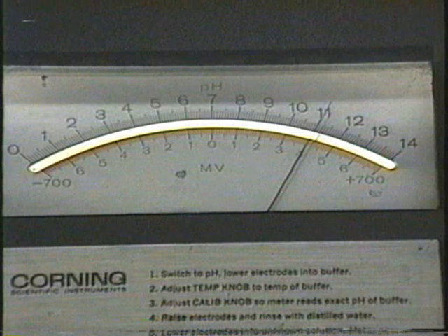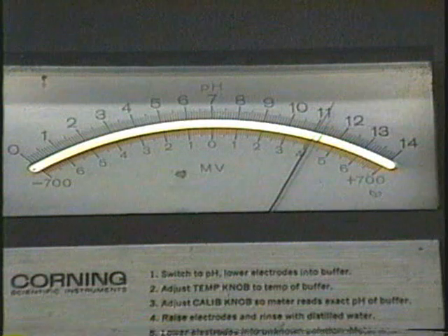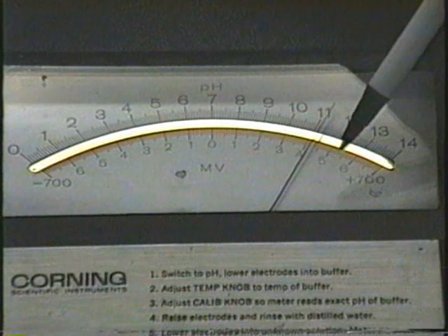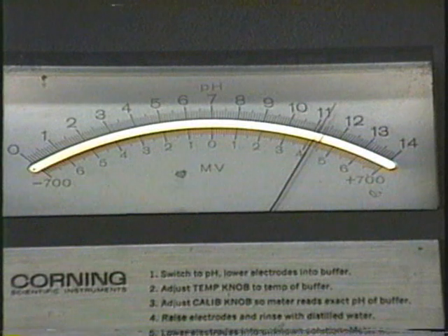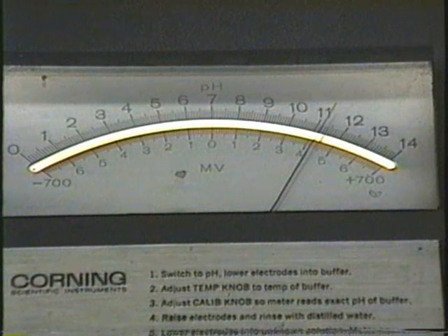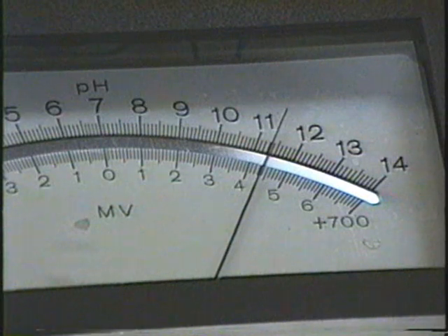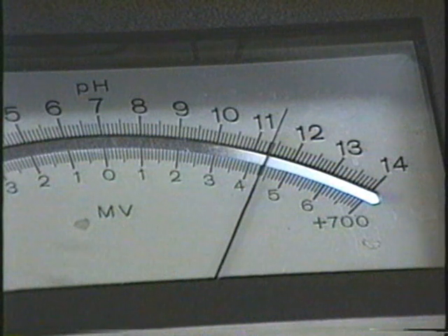Now, before we can take this reading, we must correct for the parallax error. As you can see, the camera's in the wrong place, and you not only can see the mirror, the needle itself, but you can see its reflection in the mirror. When this happens, you will have a parallax error in reading, so we'll have to move the camera to eliminate that parallax error. Here's that reading without the parallax error, and as you can see, it is reading 11.33. So with 10 drops of sodium hydroxide in that water, the pH rose to 11.33.